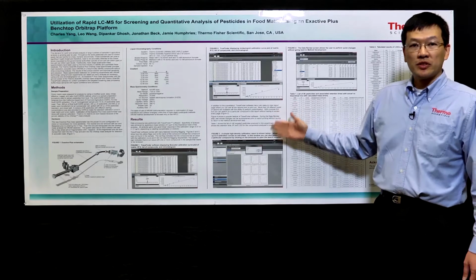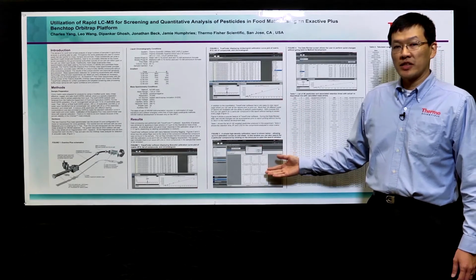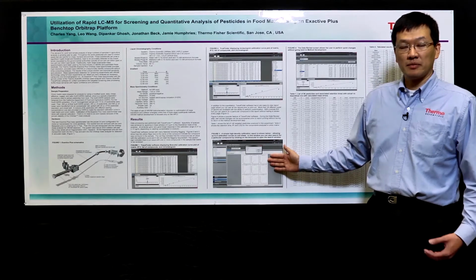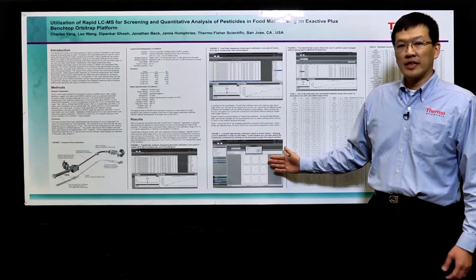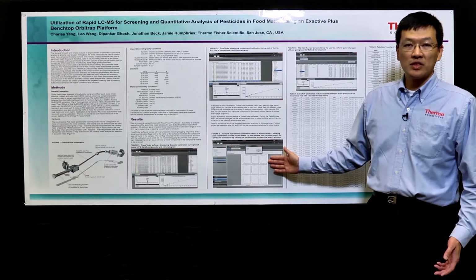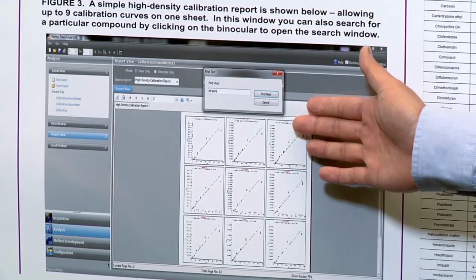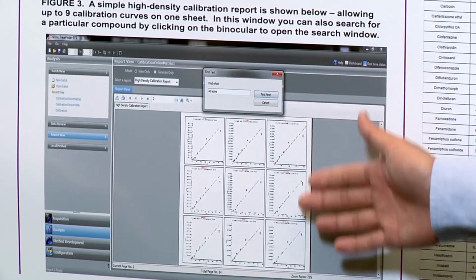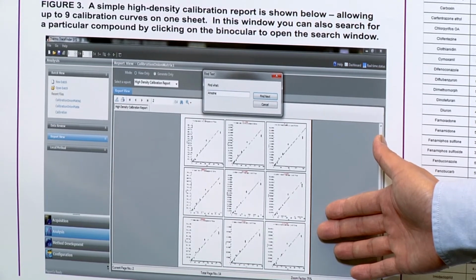Typically, when we run through the software, at the end, we have a report generation. In the report generation, we showcase how well the software can produce PDF files or Excel or Word templates so that you can actually import these things into a LIMS system or print. In the generated report, you can search for a compound by typing it in the text, and it will automatically go to the data where it is stored on the PDF.